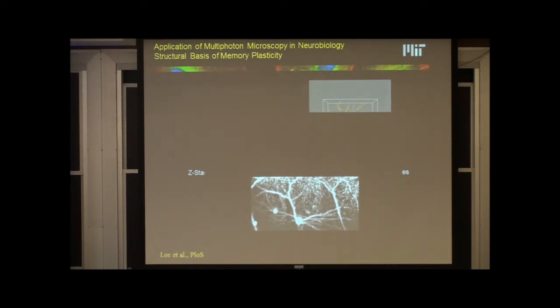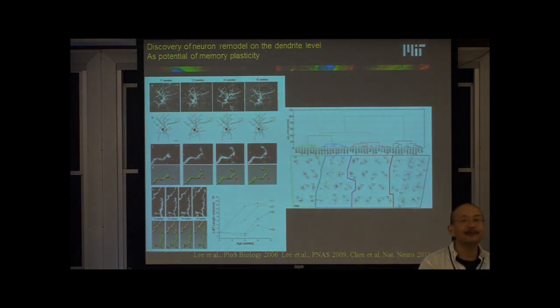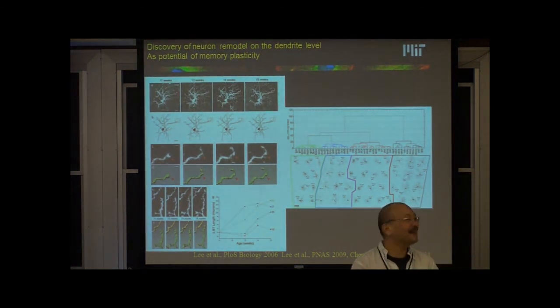Yeah, question. Do you need fluorescence for two-photon? Also, do you need fluorescent tagging labeling for two-photon? Depends on what you want to see, right? For tissue, what do you want to see? Tissues. Depends on what portion of tissue you want to see.